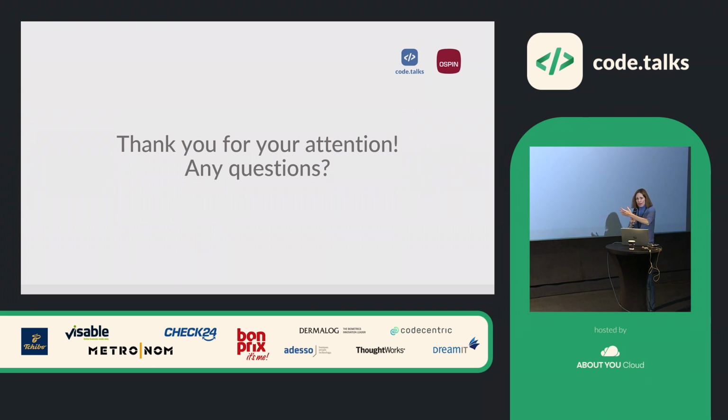Right now, since we don't have it, this condition is like, I know that more or less the system reaches 37 degrees after, I don't know, 3 hours. And so I set the phase to last for 3 hours. If I had this condition, I could just set, okay, if my temperature sensor reaches 37, then switch to the next phase. So in that sense, it's more like the current value.